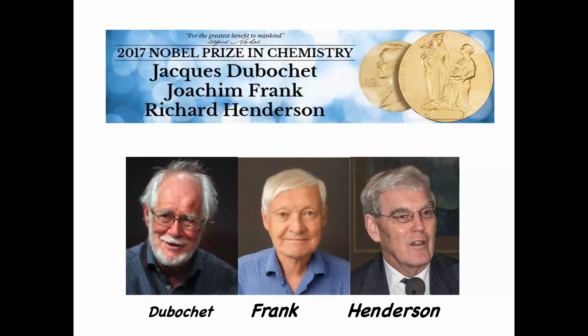The principle for three-dimensional reconstruction of electron microscopy images was proposed quite long ago. And then during the past almost 60 years, the technologies advanced such that single particle cryo-EM has been able to deliver near atomic or atomic resolution structures.